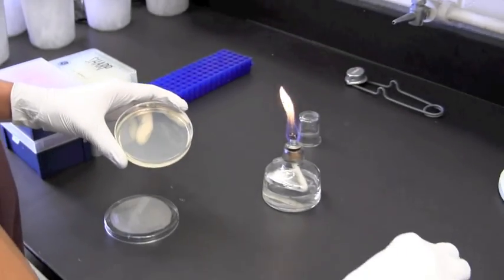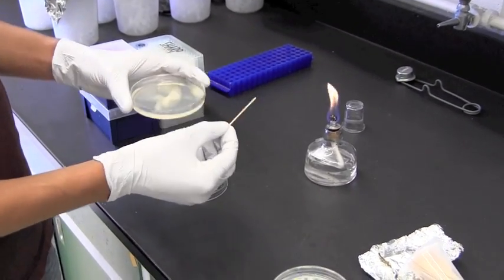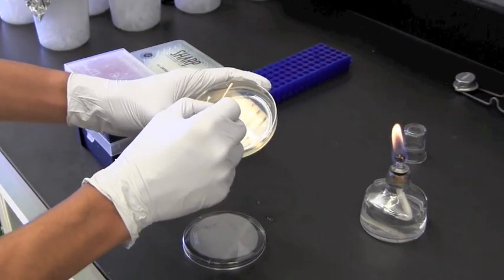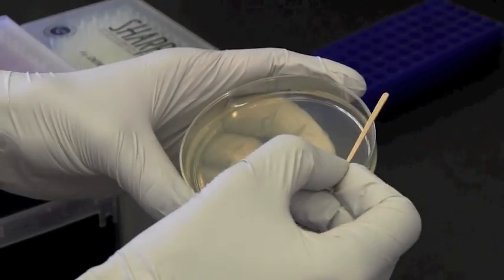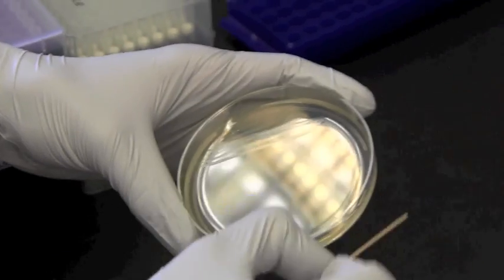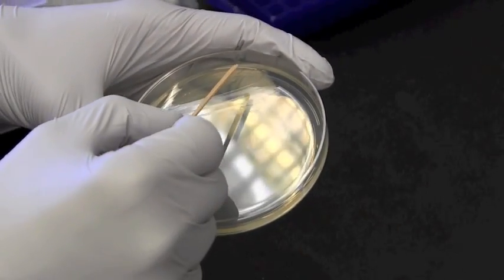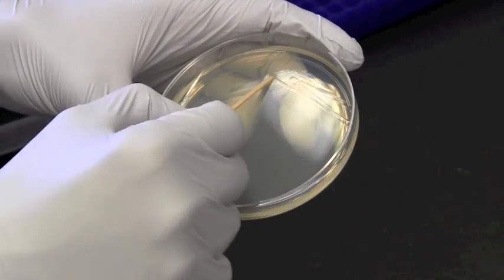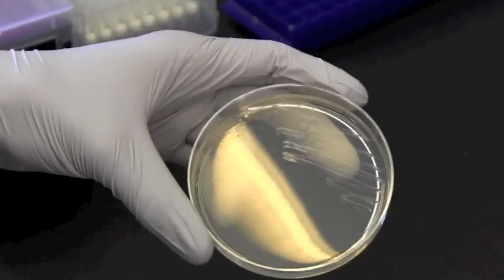Now we're going to do a second streak which is going to be slightly less concentrated than the first one. To do this we're going to overlap over part of our first streak to pick up some cells and continue to zigzag it onto another clean area of the plate. And that's our second streak.